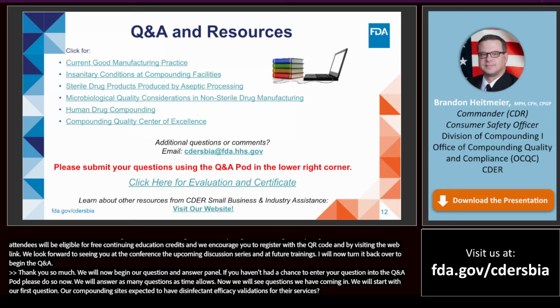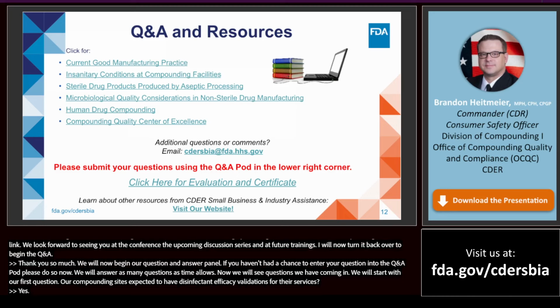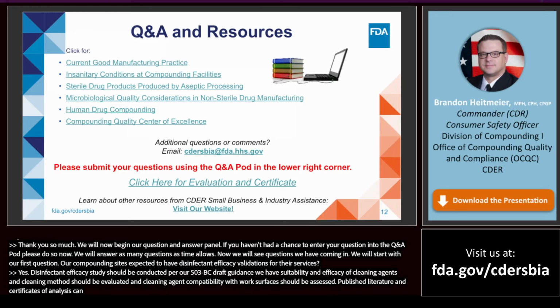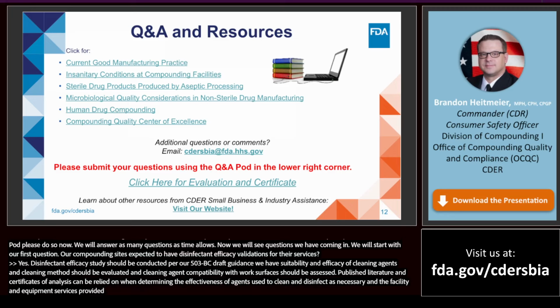Yes, disinfectant efficacy studies should be conducted per our 503B CGMP draft guidance published in January 2020. We have there the suitability and efficacy of cleaning agents and cleaning methods should be evaluated, and the cleaning agents' compatibility with applicable work surfaces should be assessed. Published literature and supplier certificates of analysis can be relied on when initially determining the effectiveness of agents used to clean and disinfect as necessary the facility and equipment surfaces, provided that the supplier's cleaning procedures are followed.